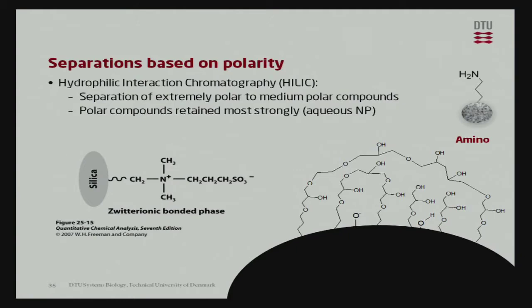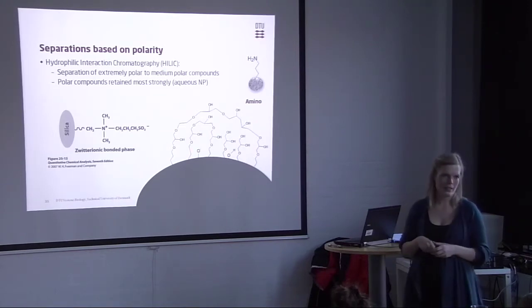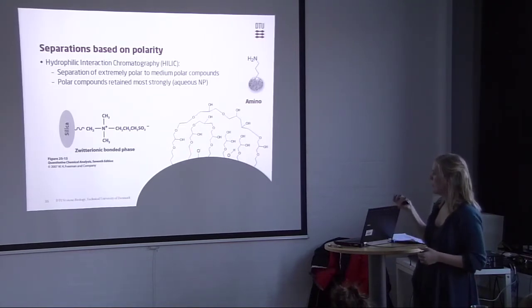The difference, like I said, between normal phase and aqueous normal phase HILIC is that when you use silica or amino as a HILIC phase, you actually put water in there deliberately. Because here you see that silica surface, and when you put water in, all that layer will be filled with water. And that water layer is actually your stationary phase. So it's the water layer that is important, and not necessarily the functional groups themselves.